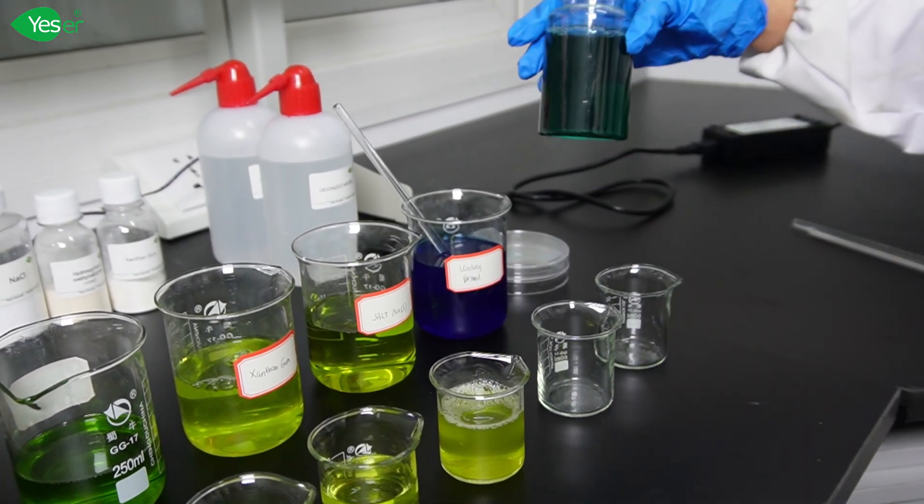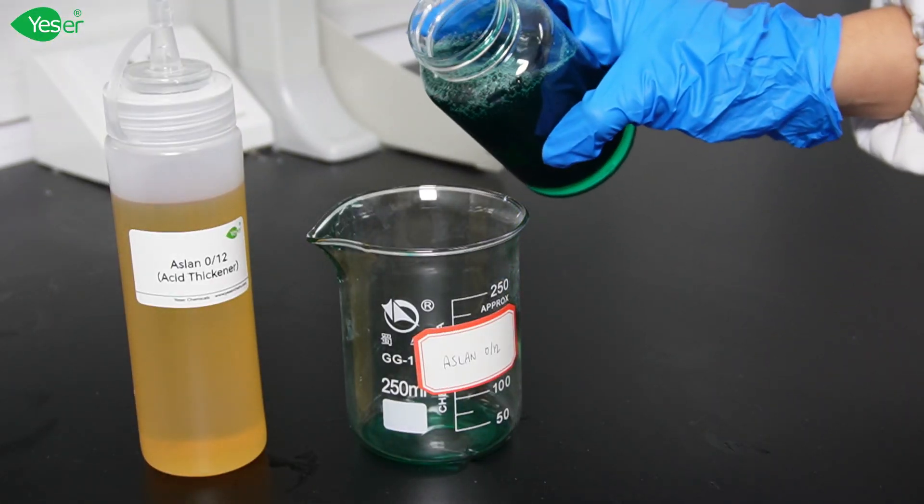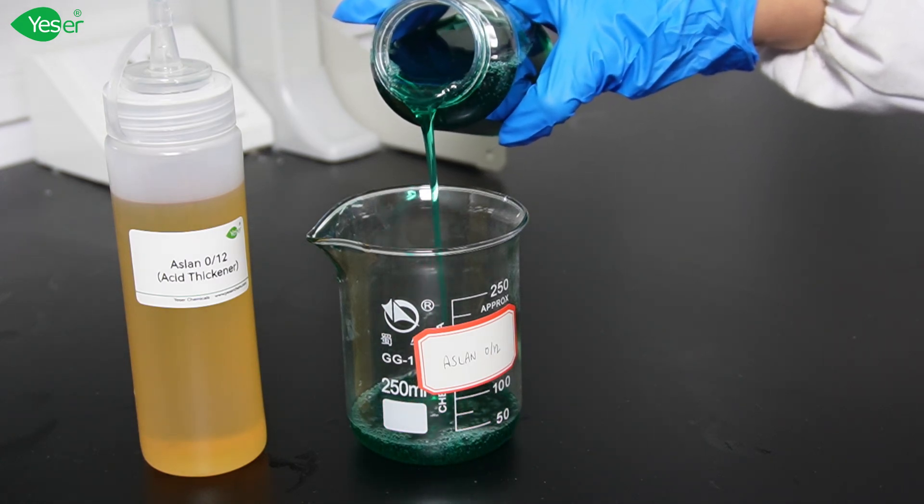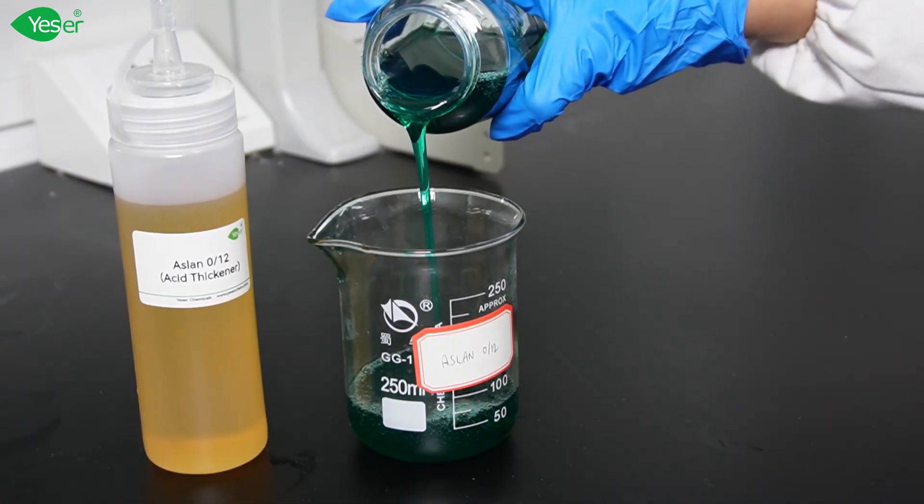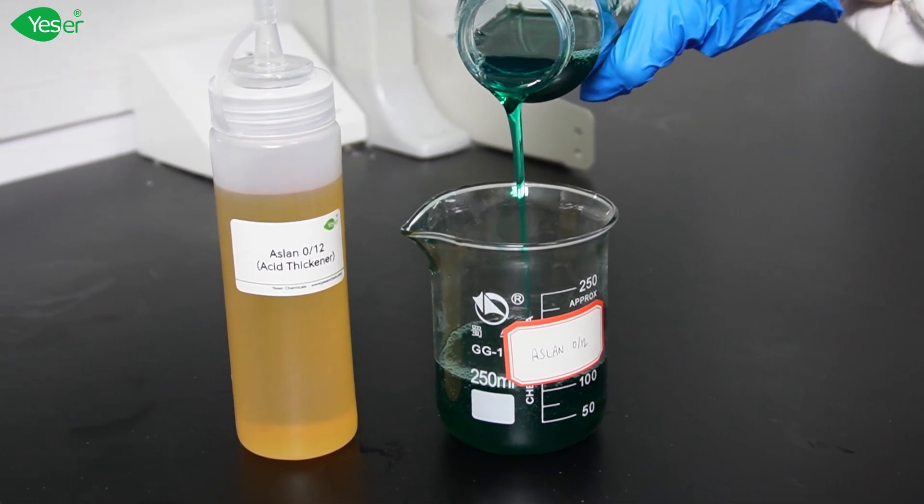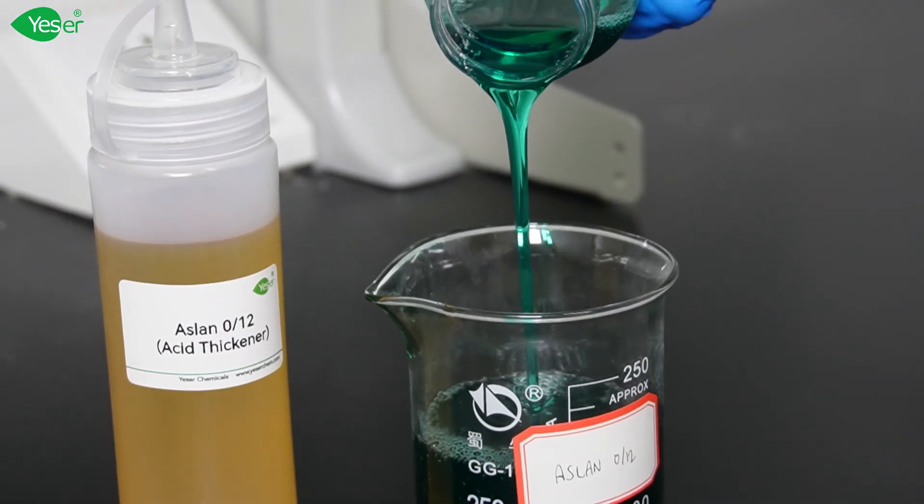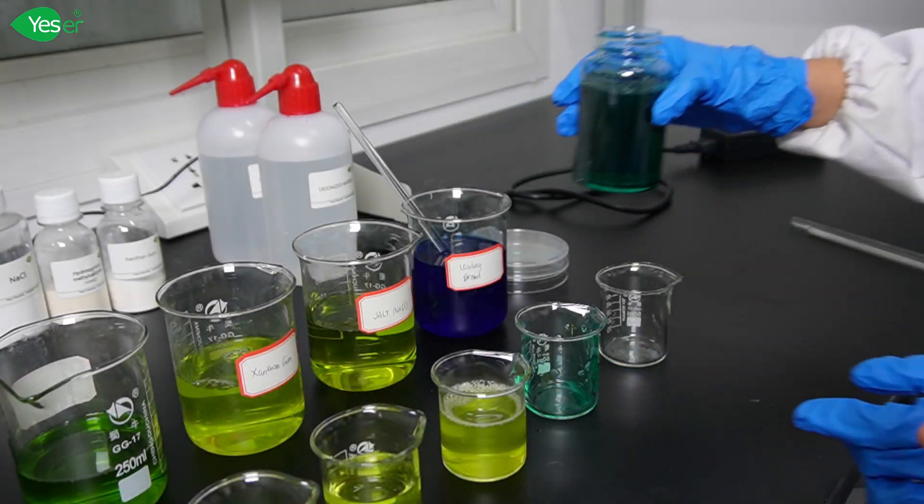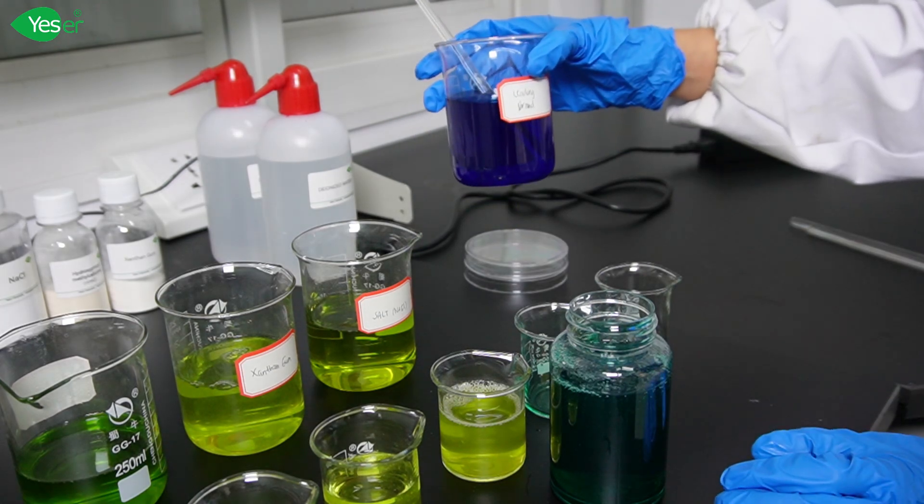Now for the last thickener, using Aslan 012. As you can see, Aslan 012 has a stable, smooth texture as we pour it down the container. This is a desirable attribute for our thickening agent in toilet cleaner formulations. Also, Aslan 012 doesn't form that jelly-like gel consistency or phase separation compared to other thickeners. Now we're going to compare the viscosity of our Aslan 012 with the leading brand toilet cleaner.